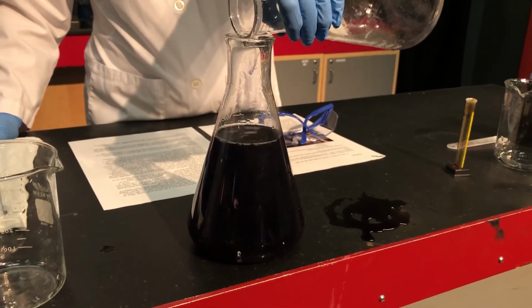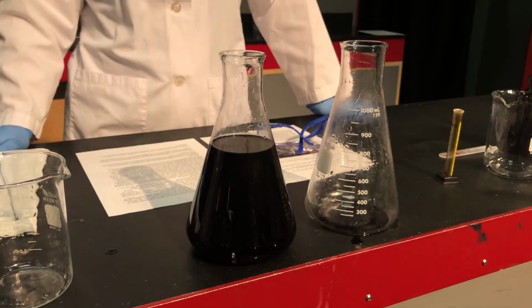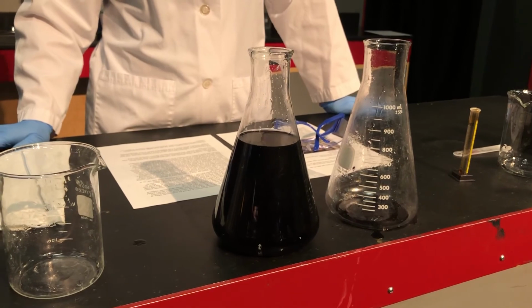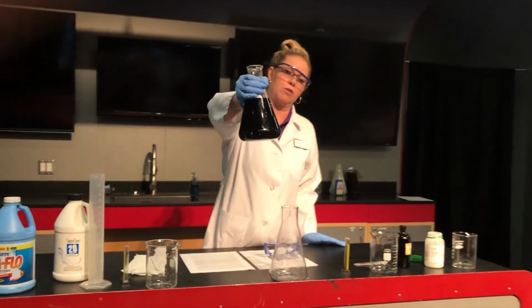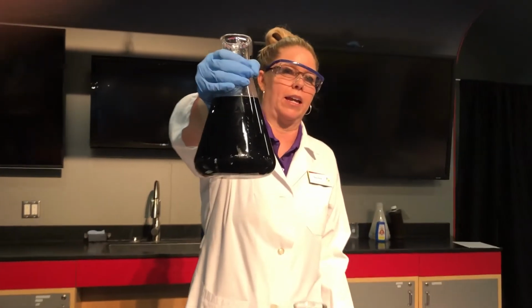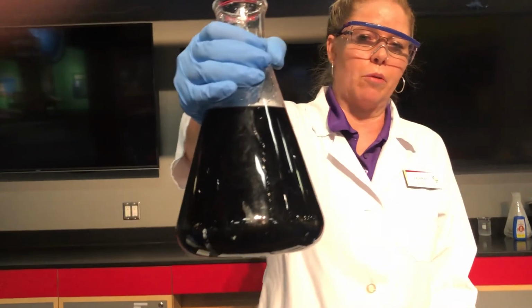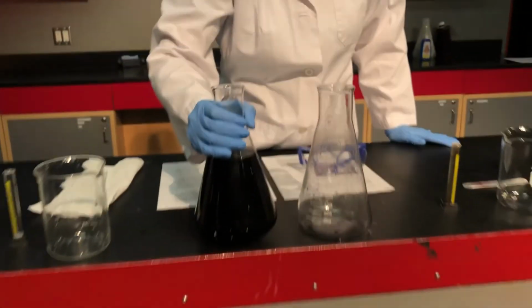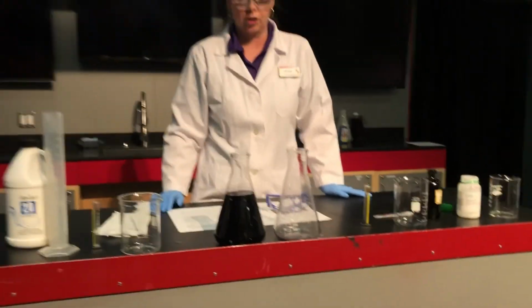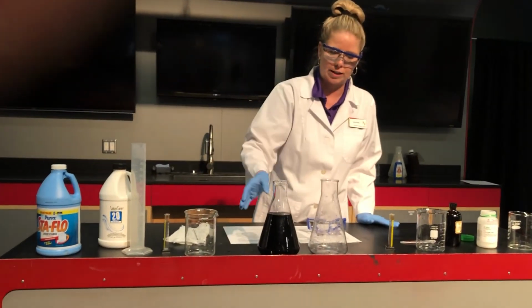Oh my goodness, did you catch it, Cole? Oh, I think you zoomed in just exactly at the right time. So you can see why sometimes we say think ink. It is now turned so dark that it looks almost like ink. So I'm gonna have my cameraman Cole come in and take a look. Now we're using our eyesight as our observational tool to see that a reaction has occurred, because it did go from a clear or cloudy substance to this dark substance.